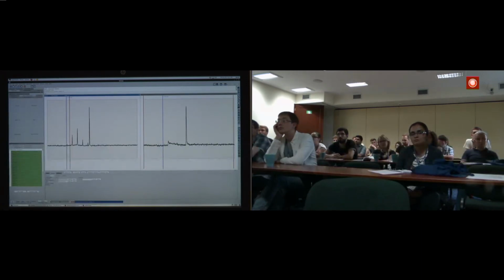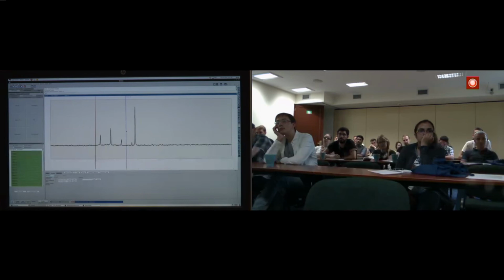But maybe let me just describe. I would like to say a few words about this spectrum because, as you can see, there's a dramatic change over here. Instead of 2 lines, which we have expected, we surprisingly observe much more lines over here. So there are more signals.